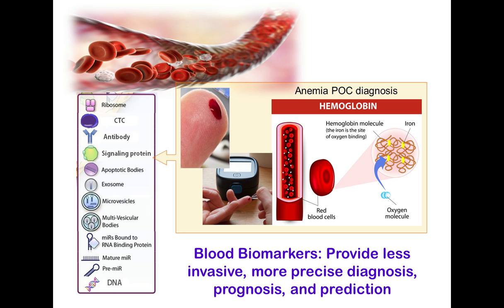With such three-dimensional microfabrication skills, we want to utilize them to advance biomedical research. The first application we employ is biomarker detection. As we know, there are biomarkers circulating in the bloodstream, and if we can detect a certain protein, a biomarker indicating the disease status, from a single drop of blood, that can make diagnostics much easier and cheaper. These biomarkers can provide less invasive, more precise diagnosis for prognosis and prediction.